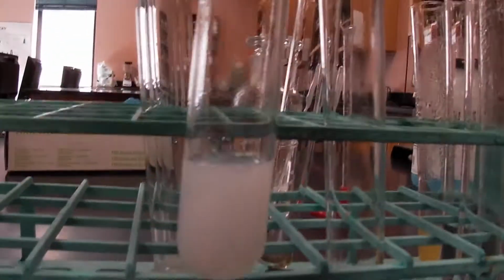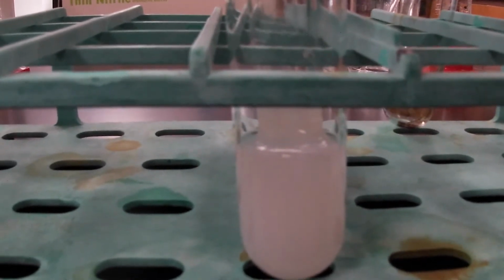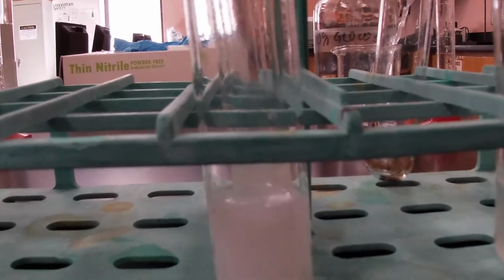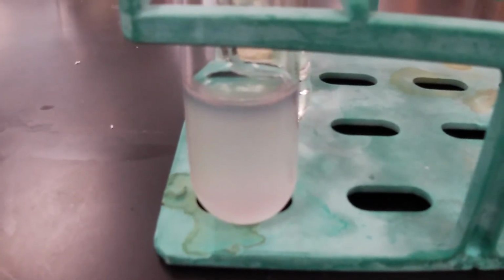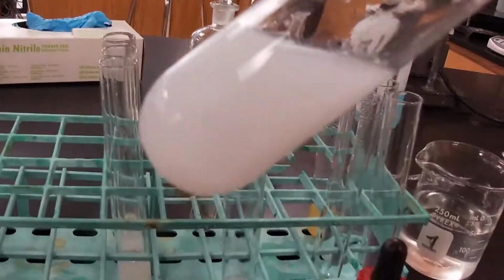definitely some precipitate forming. We got a really white solution, especially on the top. We'll go ahead and add another couple of drops so that you can see in a zoomed in fashion. And as soon as I add it, we'll move it from the top. And if you can see from the top, you'll notice those globules of white stuff. We got a nice little film of blueness for our starch. We got our precipitation going on. See there, zoomed in.